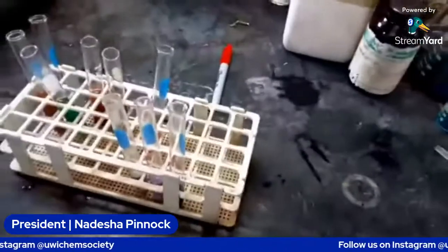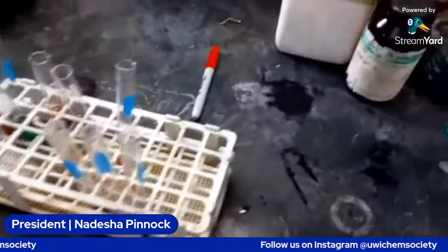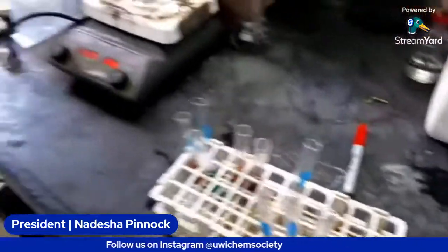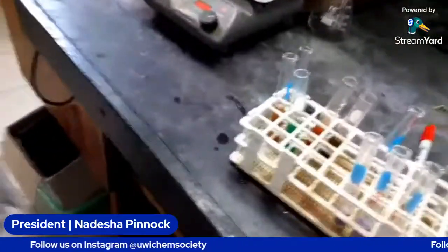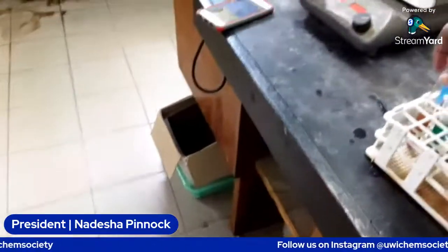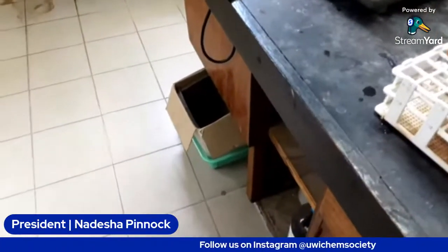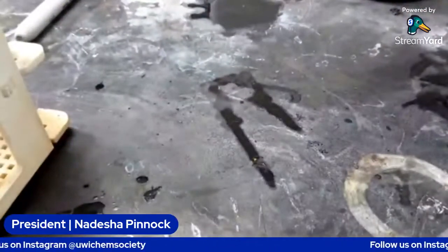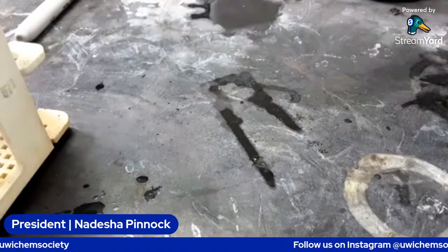So we're going to run the reducing / non-reducing sugar test again, so we can know which was which. We use new testing to compare them. And then let's go through the theory for the iodine starch test while we're doing that.